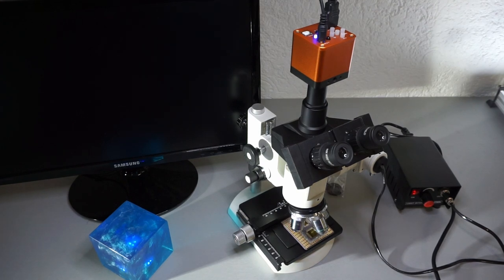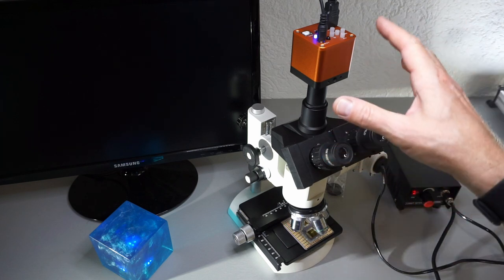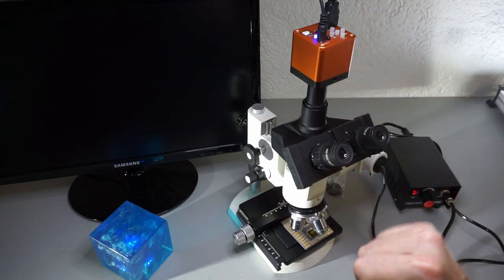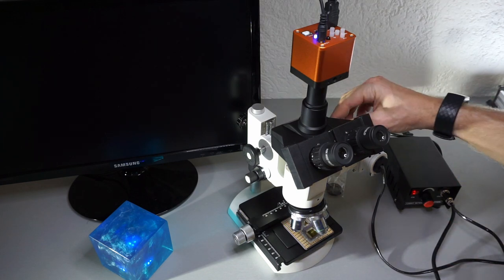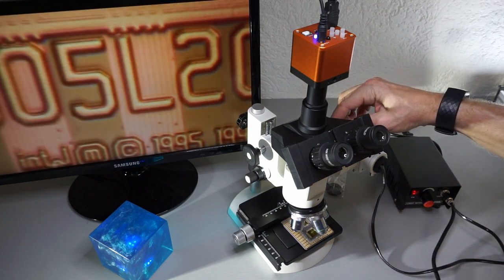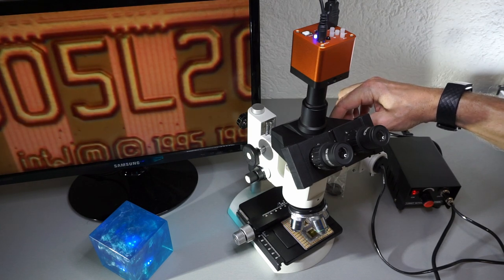The setup is ready. I have attached also a screen to the camera. The Pentium Pro is installed. We are looking at a certain segment, we are looking at the second level cache. For some reason I have no picture, but I think it's because the light source is not there.